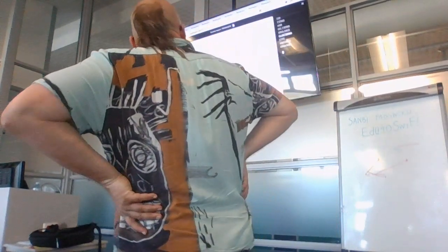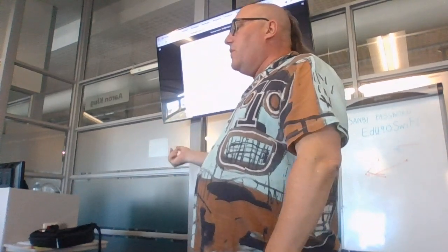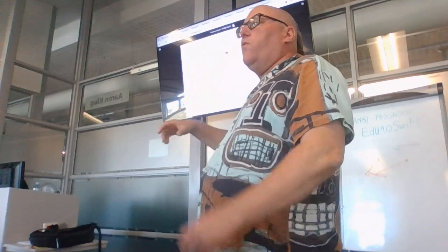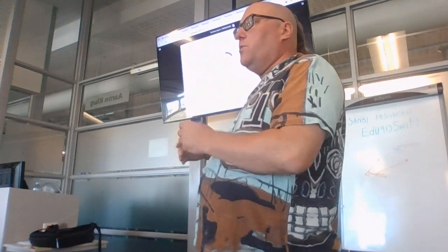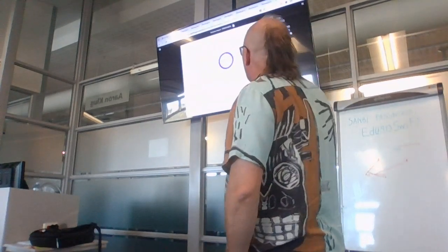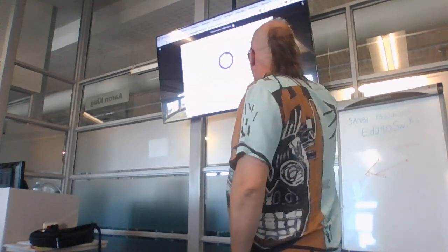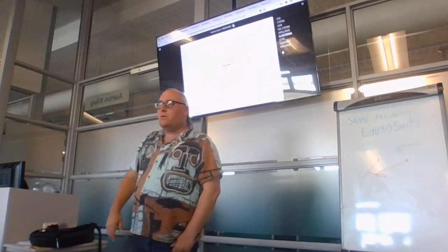But yeah, I just wanted to illustrate that Pathogen Watch is a very useful web resource, but it works much better if you start from an assembled genome than if you give it FASTQs, because it takes a very long time to process FASTQs. Better to do your FASTQ processing yourself, and then get your reports from this. Okay. There is another website called VicPred.